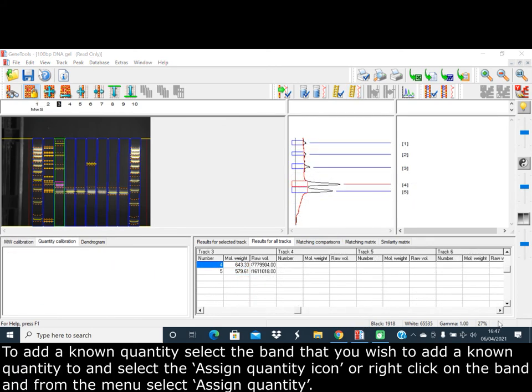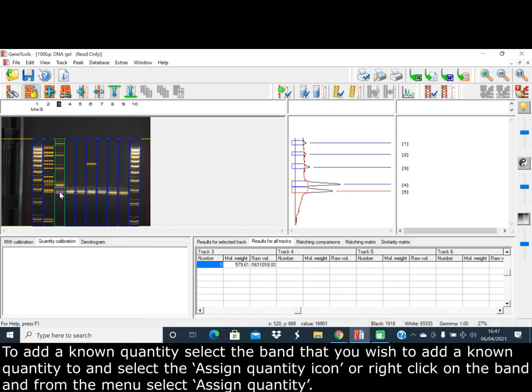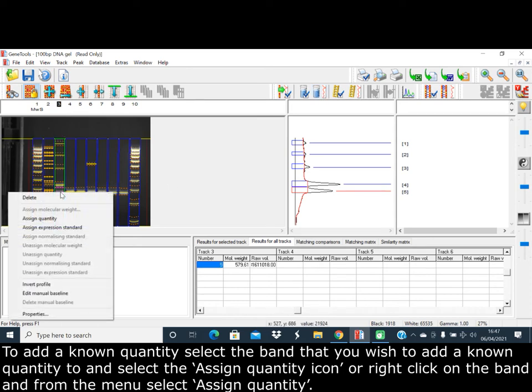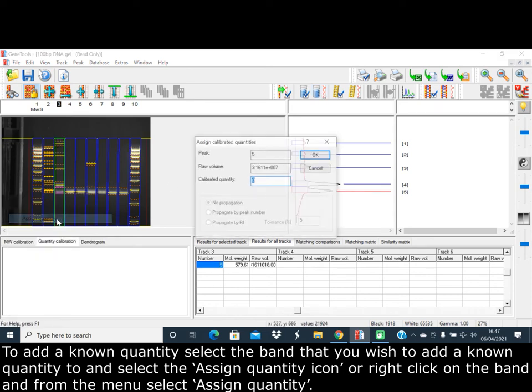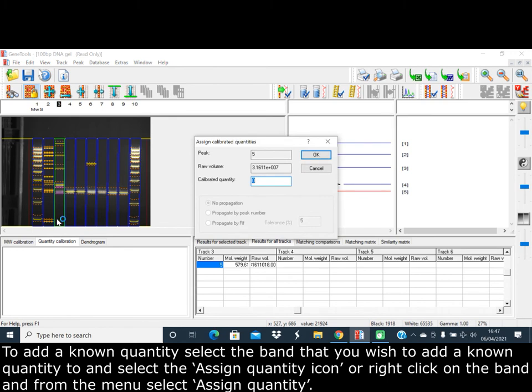To add a known quantity, select the band that you wish to add a known quantity to and then select the Assign Quantity icon, or right-click on the band and assign a quantity from the menu.